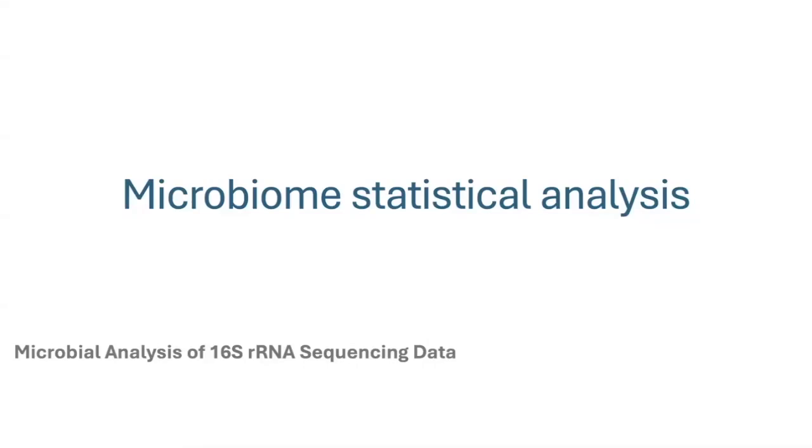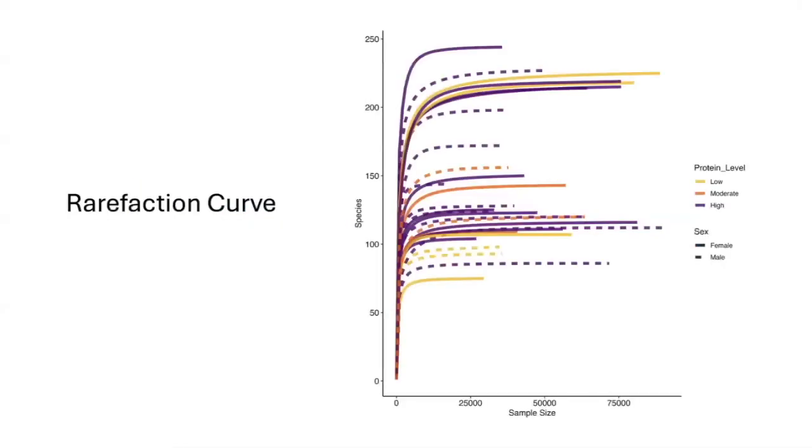Welcome to the Microbiome Cloud Computing module. In this video, we will talk about common microbiome analysis plots that you will see during the workshop.